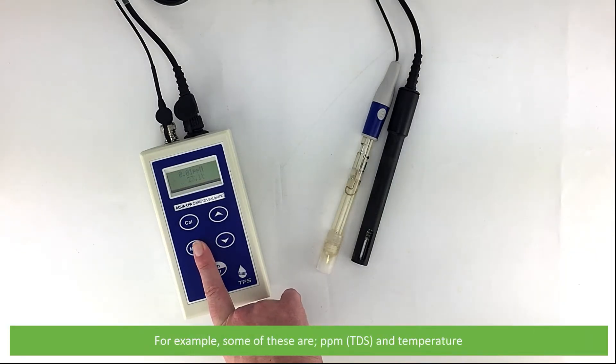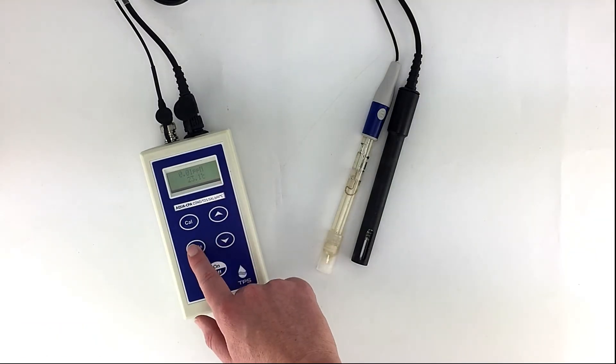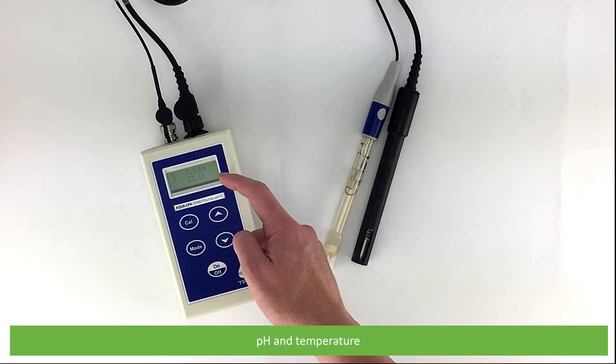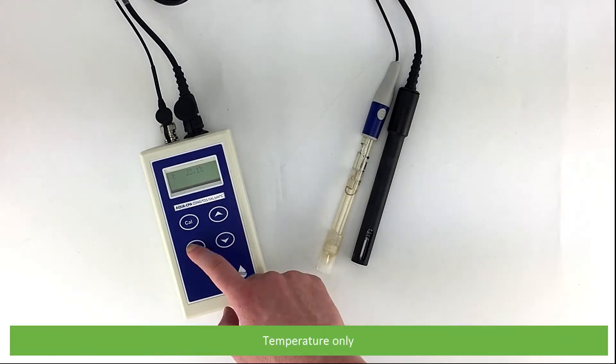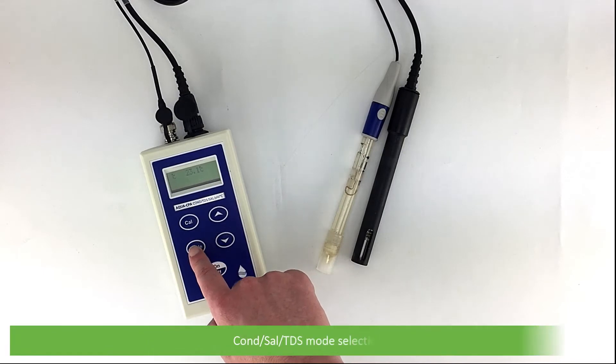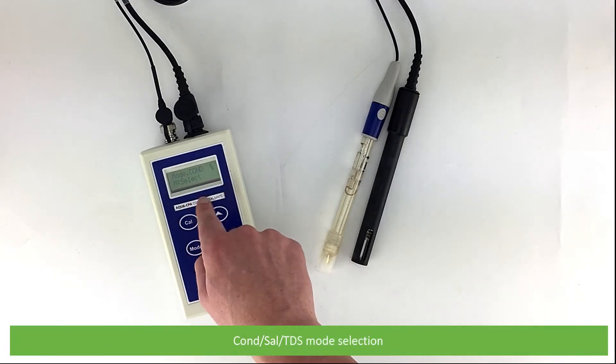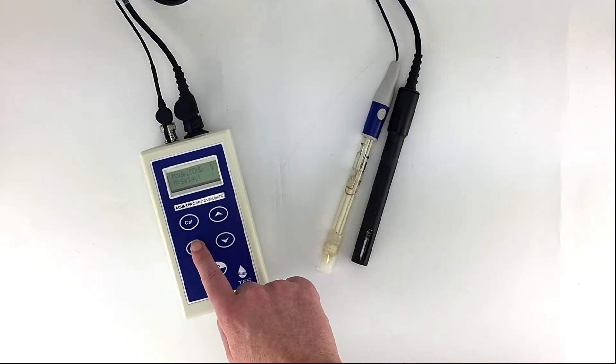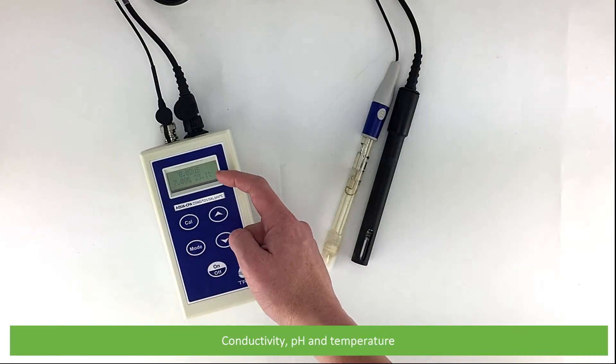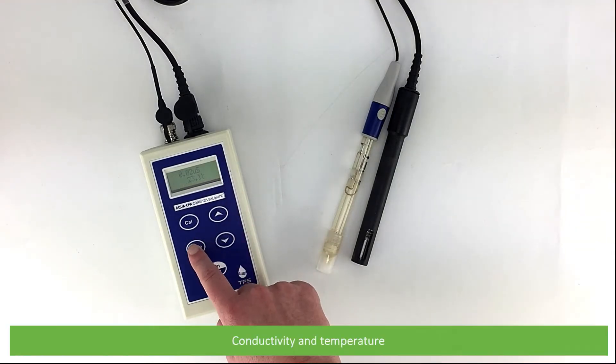These are parts per million and temperature, pH and temperature, temperature only, conductivity, salinity TDS mode selection, conductivity pH and temperature, and conductivity and temperature.